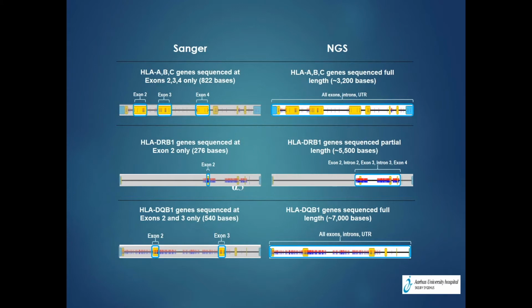Sometime last year we changed from the full flow cell to the microflow cell, which has improved the throughput a lot, and the time from starting up samples to getting out the answers has improved a lot, which has been a great achievement of change for our lab. Because what clinicians in our unit demand are fast answers.